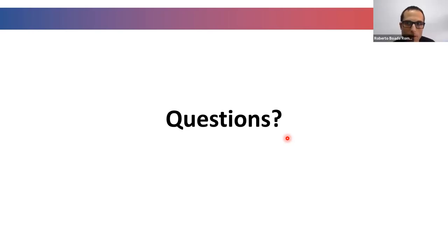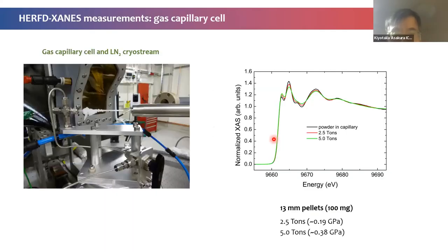Yes. So then on the top side, you have a thermocouple to measure the temperature, and a heater. You showed the picture of the cell. Yes, there is always a thermocouple in contact with the sample. Let me just go back to the sample. Yes, the thermocouple is inside, in contact with the sample, monitoring the temperature.